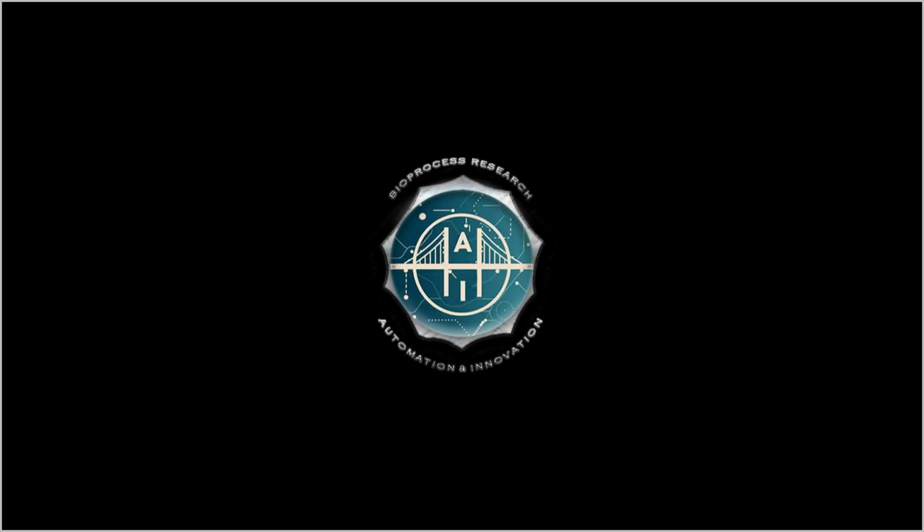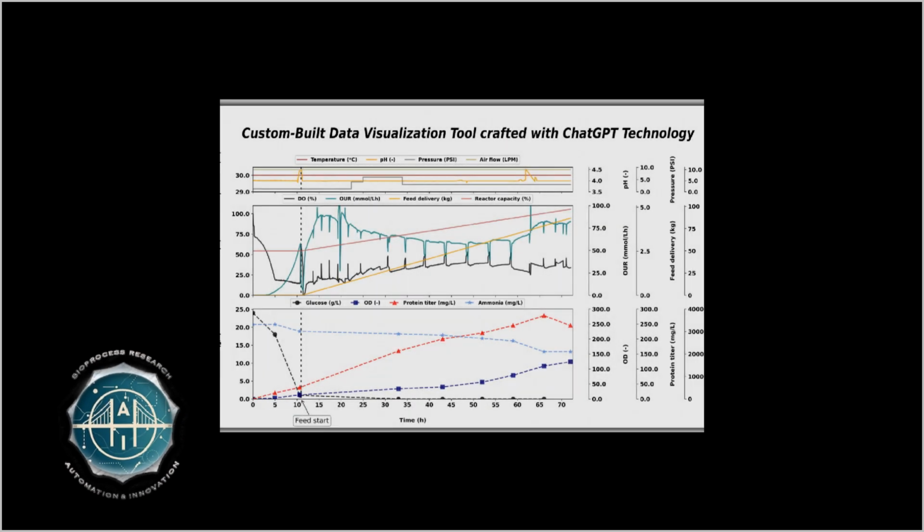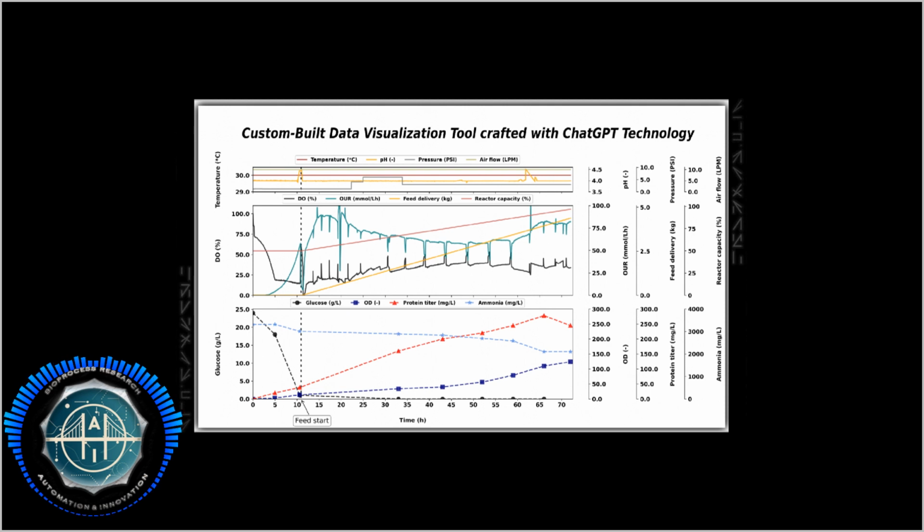Hi. In this video, we'll be showcasing a practical example of how artificial intelligence can make Python programming readily accessible to everyone. Yes, even to those with no coding experience whatsoever. We'll be walking you through the process of building this custom data visualization tool using plain, everyday language, and demonstrate how the tool is used to visualize real-world pilot-scale fermentation data.